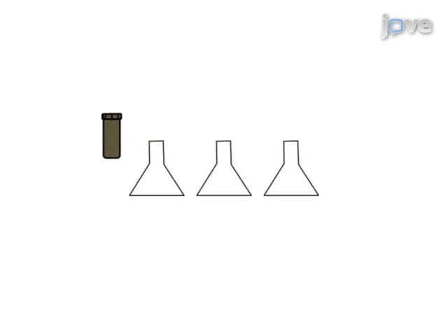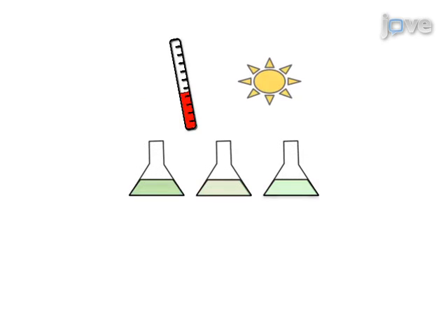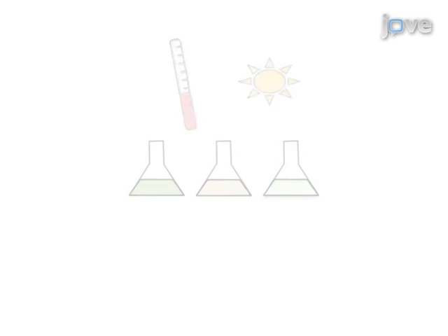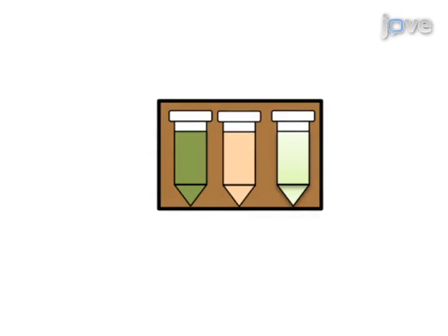The lake water samples are then inoculated into various growth media and incubated in a growth chamber equipped with a temperature regulator and lights for four to six weeks. The cultures can be transported as needed at four degrees Celsius.